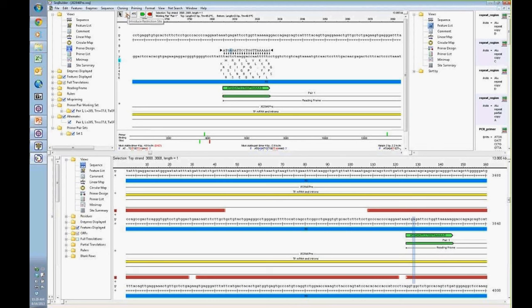There's also a palette tool for introducing a restriction site. So we will actually use this to add the SCA1 restriction site at the 5' end and the XHO1 at the 3' end. There's also a palette tool to introduce a codon change or a mutation.